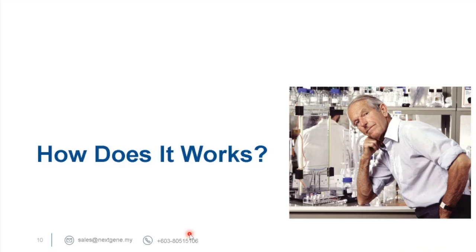Okay, so when we move on from the introduction on some of the applications of DNA sequencing, now I will proceed to how Sanger sequencing actually happens. How does it work?